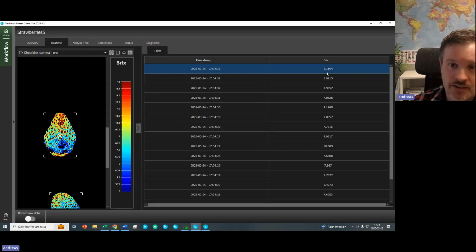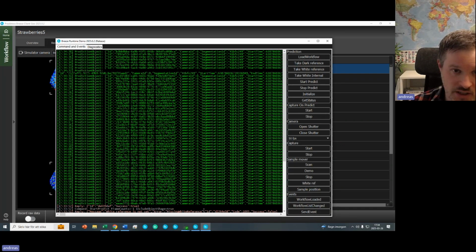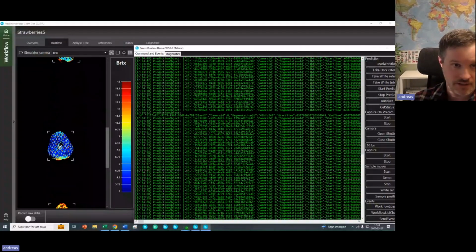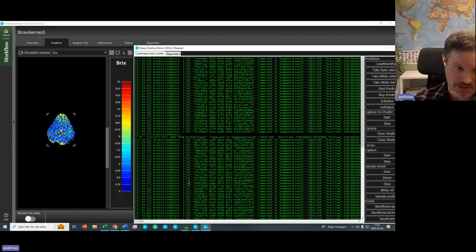We are calculating the Brix value. And in this software, for each strawberry we are processing, it will send this information out. So here, in addition to the Brix value, we have timestamps for when we analyze the objects. And we can, of course, calculate other things like where it is in the image and things like that.